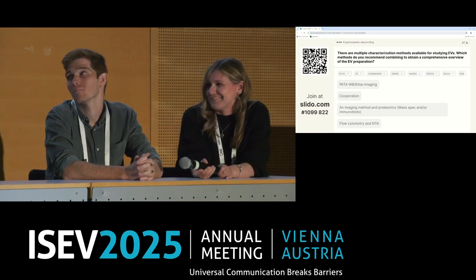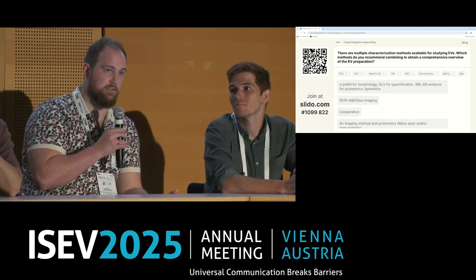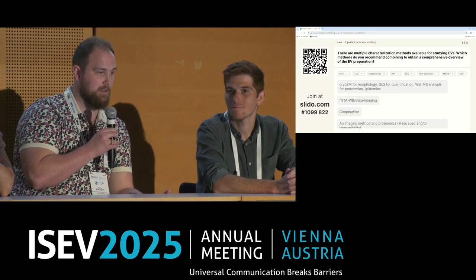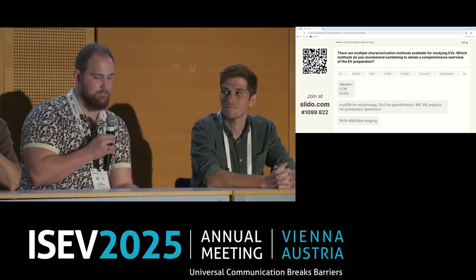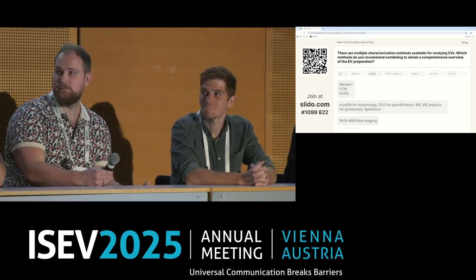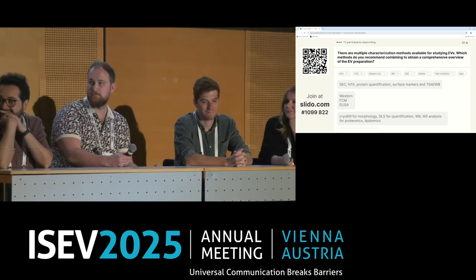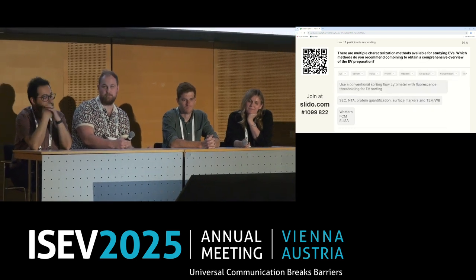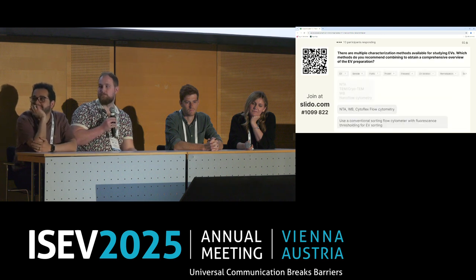But also Western blot is a very good place to start to check for the different EV markers and even non-EV markers if EM is more difficult for you to access. So there are different levels of characterization methods that you can use, and even with the very straightforward ones that are available, you can already have a good indication, but always look for collaboration.